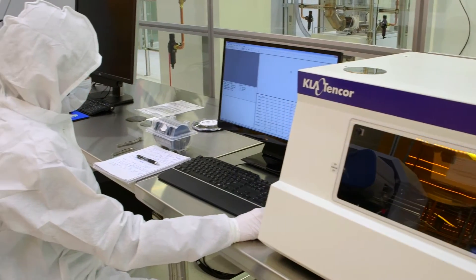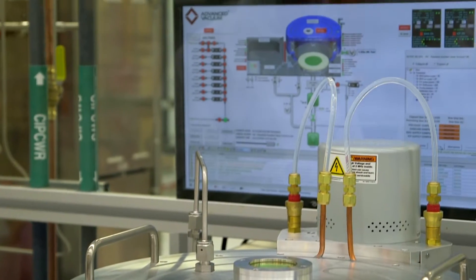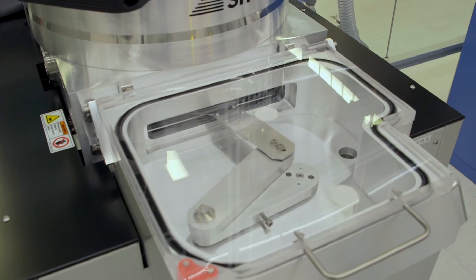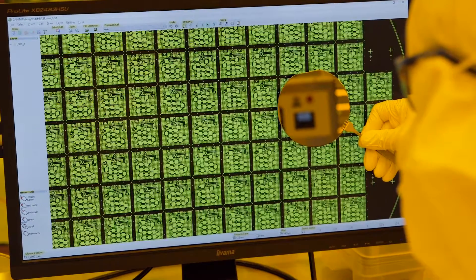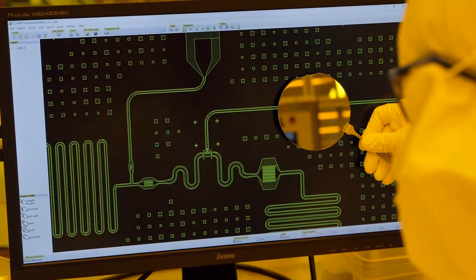What we're looking at is the Pritzker Nanofabrication Facility, which you might think of as a modern machine shop of the new millennium. Ways to make devices and technologies at the submicron scale, all the way down to handfuls of atoms.